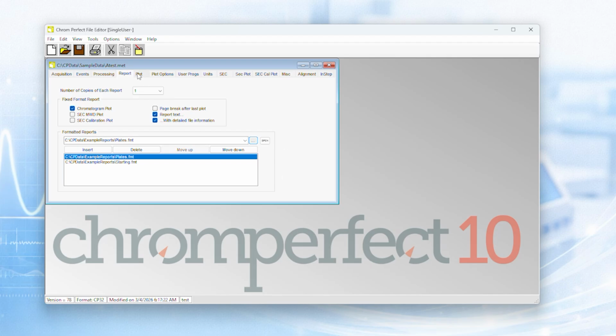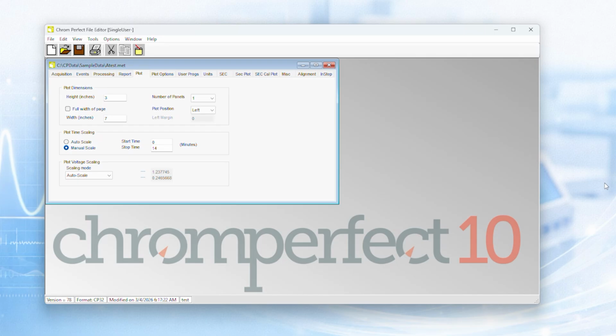Next is the Plot tab. The Plot tab controls how the chromatogram is displayed and how it appears in printed or formatted reports. This includes scaling behavior and display configuration. These settings influence presentation, not acquisition, and not quantitative interpretation.